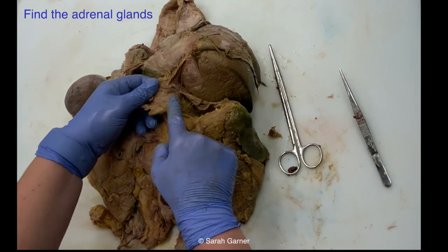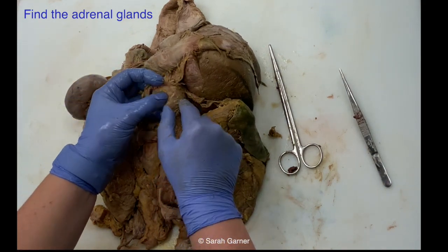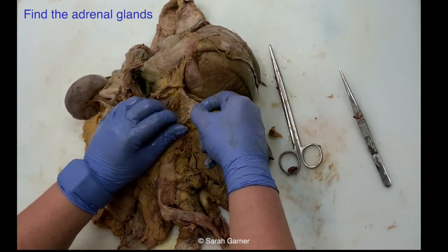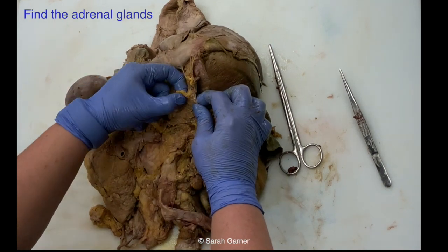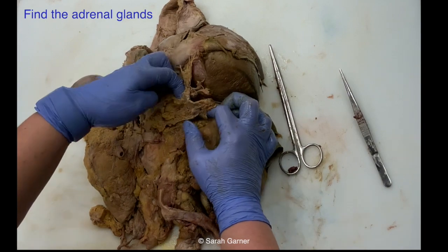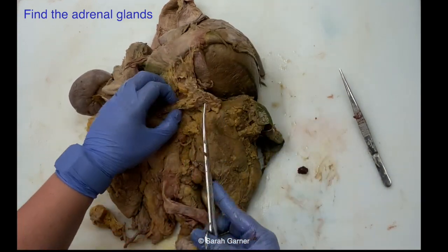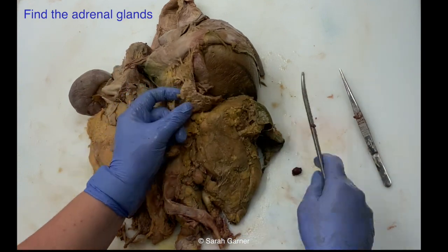Right there, you can see it, see? Once you can see the outline of it, then you can peel off or trim off the rest of this fat and the vessels. So this is your adrenal right here. And what I feel right here is also hard, but I know that that's one of the vessels. Remember, you're going to have three adrenal arteries, a superior, middle, and inferior, and you're going to have one adrenal vein. Unless there's something that you're suspicious of, you don't need to save the vessels. You can just cut through them and remove just your adrenal.